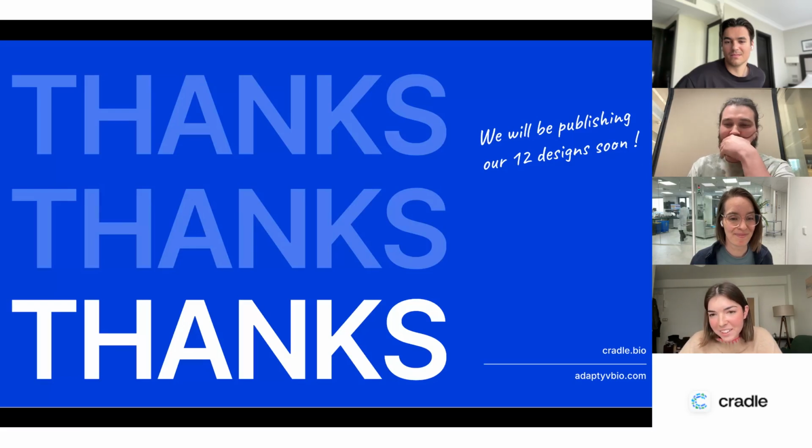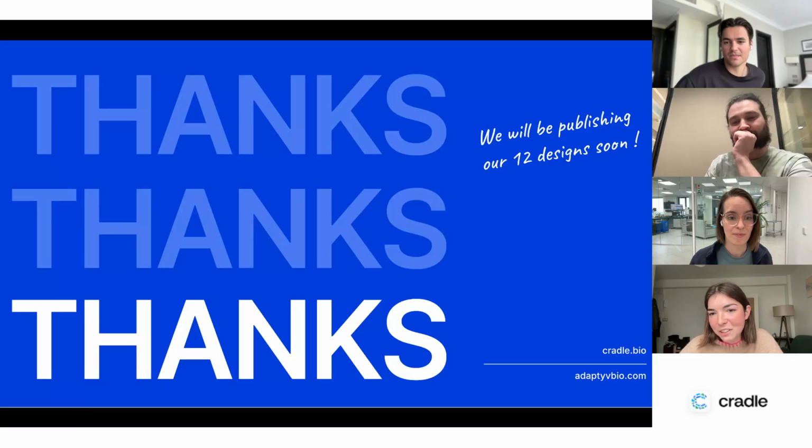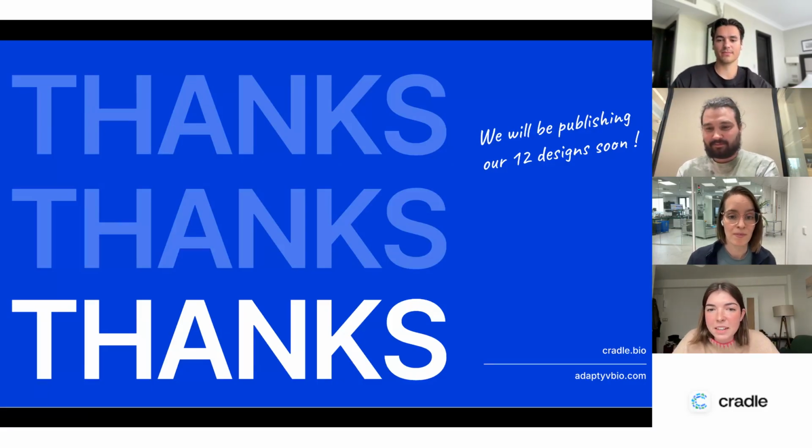So for the no lab part, at Cradle, as you can see behind Elisa, we actually do have a lab, but this is only for internal purposes, to be able to optimize our algorithms internally. But if you don't have a lab, you can always turn towards CROs. For example, you could generate sequences with Cradle and then send them to Adaptyv for Adaptyv to assay them. I guess there are other options, but this is a requirement that we, at least at Cradle, have for our customers: they need to provide the experimental data for us. Our internal lab has a different purpose here.